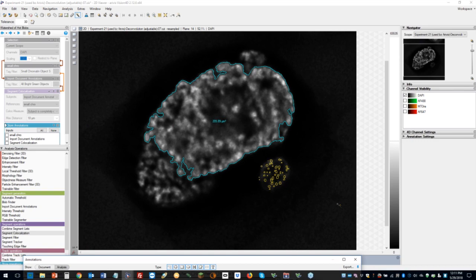Okay. Next question here is from Baptiste, and they're asking, are there any quality control algorithms for the reconstruction of 3D SIM images? Quality control algorithm for, so let's think, what do you want to measure?